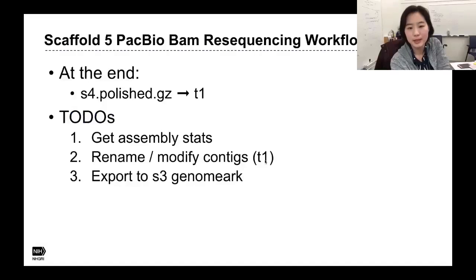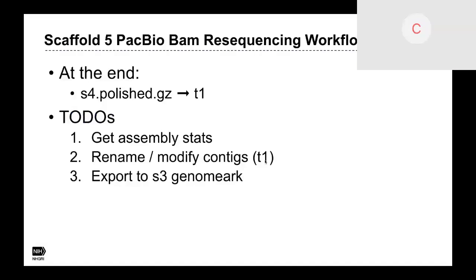I have one pretty small detail actually, but at the BioNano step. I saw that there are some other research groups that provide the specific XML file for the configuration, and I heard from them that if they use the configuration file that's specific for that enzyme, they got a slightly different number of hits, and they mentioned that that's because the p-value cutoff in that configuration matches the enzyme better. So I just wonder whether the VGP group would be interested to incorporate that into the pipeline as well. If so, I can provide more detail after the meeting today.